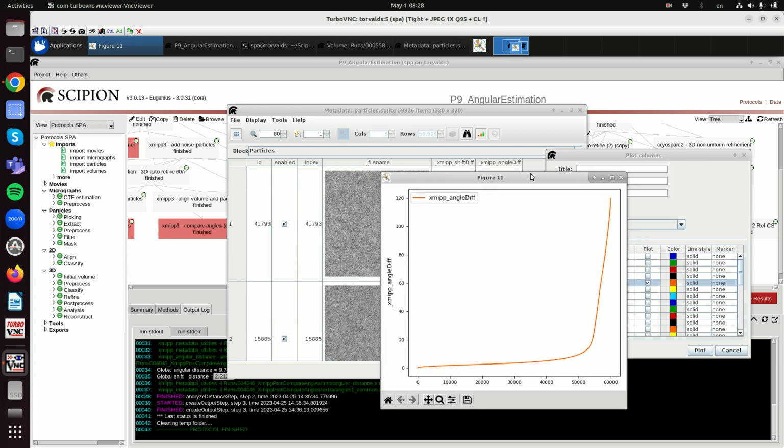So again, the same message: having a very good result depends on spending a lot of time on the data, making a lot of good choices, choosing the particles that are stably aligned, that you are sure the angular assignment is the right one. And for that, a simple processing, this fast food idea of making it quick, doesn't really work.